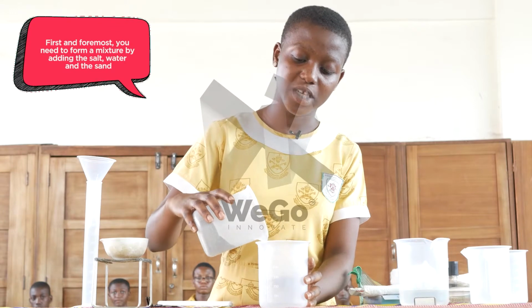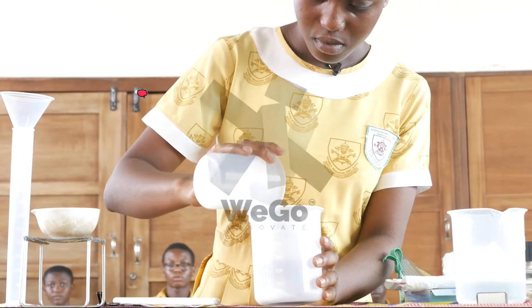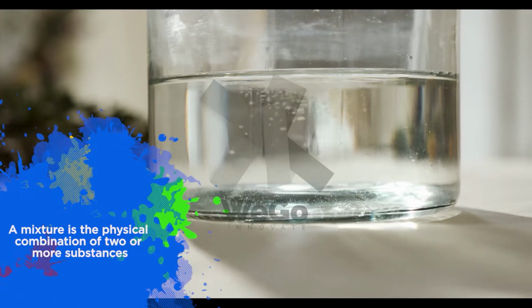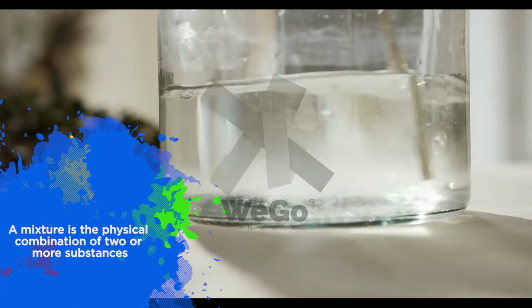You need to form a mixture by adding salt, the water and the sand, and stir to make a uniform solution. A mixture is a physical combination of two or more substances.